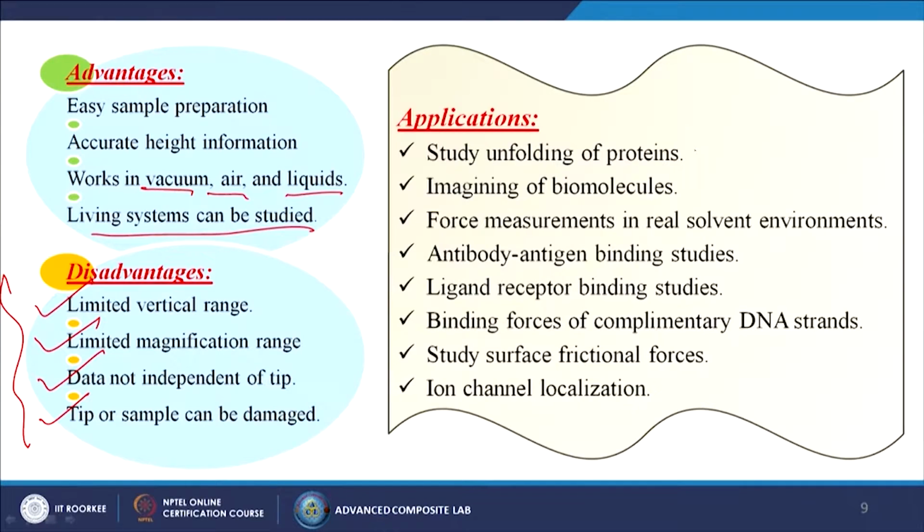Of course, there are certain applications. What are those? Study of unfolding of proteins, imaging of biomolecules, force measurement in real solvent environments, antibody-antigen binding studies, ligand-receptor binding studies, binding force of complementary DNA strands, study of surface frictional forces, and ion channel localization.